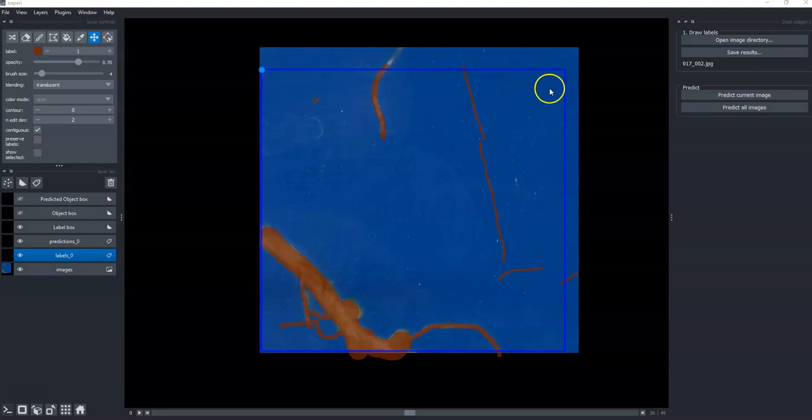Okay, so I got some of these guys. Some of them might have been really faint, so I'm not totally sure if they're really roots or not. So you know what? You can go back and do some erasing too. Man, maybe that is a root. Okay, I'm no expert in roots, so I don't know for sure if I did this right, but we'll see what we get.